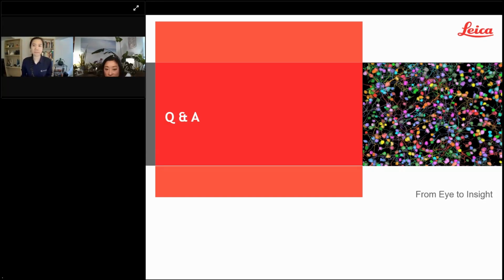Awesome. The next user sounds like a current user. This researcher asks, we use previous versions of neuron tracing in Avia to trace microvasculature. Is there any special version you plan that would specialize on microvasculature? At the moment, we do not have any plans to specifically launch a feature for microvasculature.